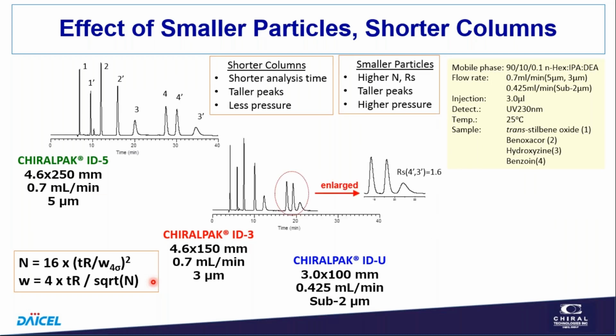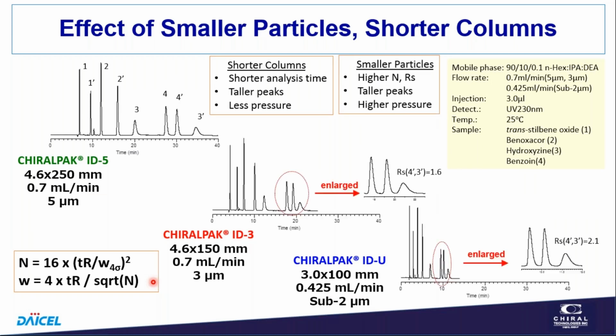And that's often discussed in fundamental books on chromatography. If you want to discuss it, I'd be glad to talk to you about it. And I will say I've had discussions with people who are very good chromatographers who have had to think this thing through, that it seems intuitively that, oh, longer columns should give you a higher column efficiency, and therefore the peaks will be sharper.